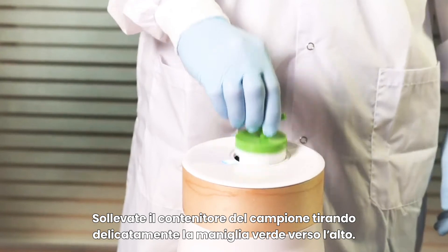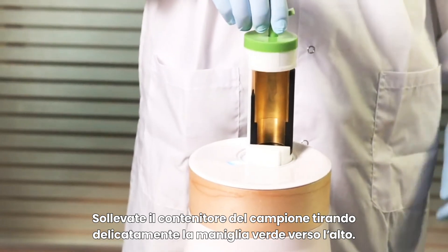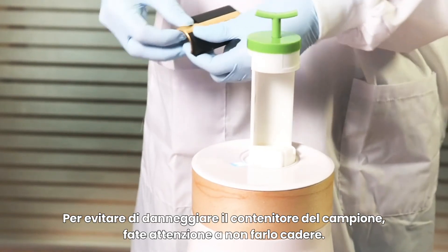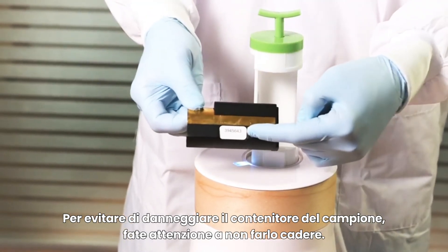Lift the sample container by gently pulling the green handle upward. Slide the reflector into the sample container. To avoid damaging the sample container, do not let it fall freely.